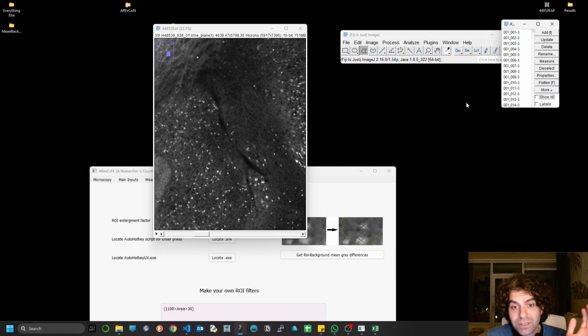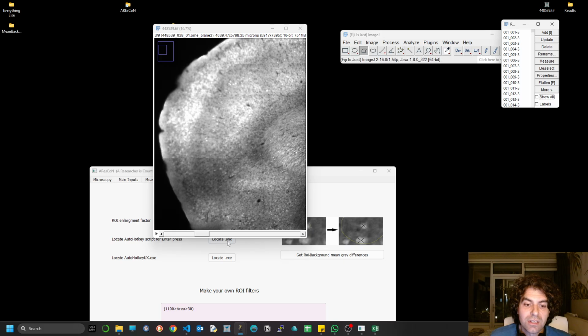So my next ambition is to integrate this spatial information with the information of the polygons, that is the rows that belong to the hemisphere, and eventually be able to produce a file that not only contains the measurements of all the neurons in one hemisphere, but also which brain region they belong to. Because when it comes to whole hemispheres, there are differences in the intensity of neurons when you do a staining in different regions.